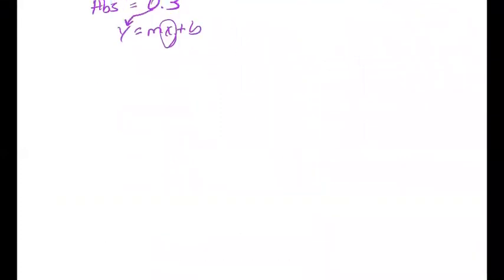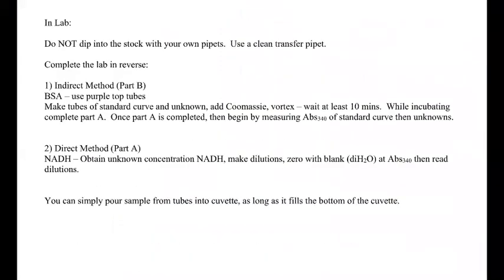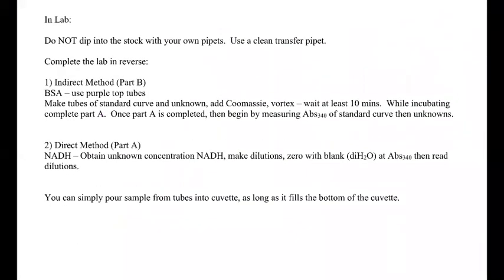All right, so that is it for us. What I want to do real quick with y'all is just to talk about a few things about the lab in particular. Do not put your pipette tips in my stock solutions. You can use a clean transfer pipette to take some out and put it in a tube for yourself, right?